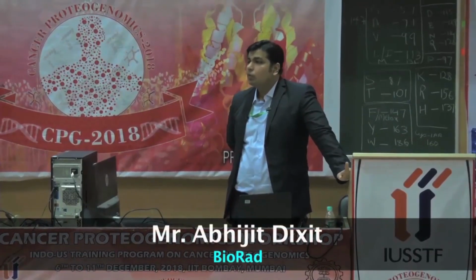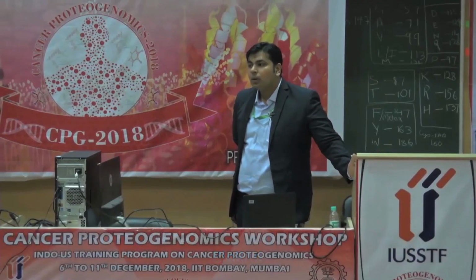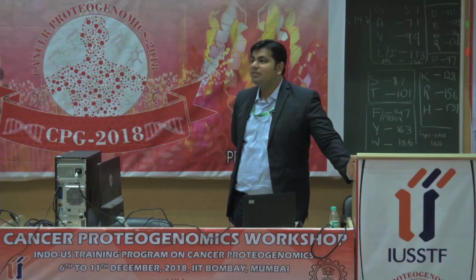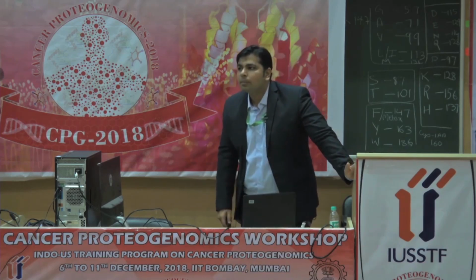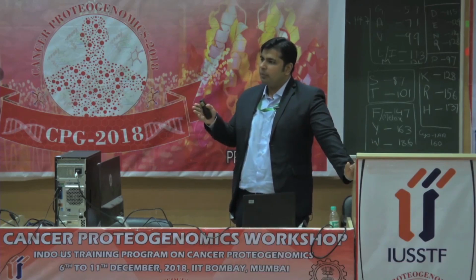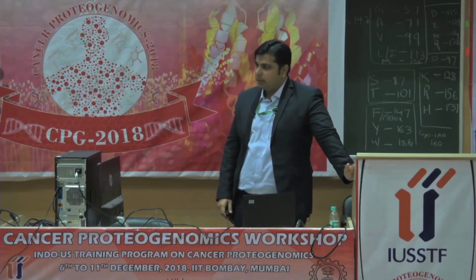Then you separate. So you want to do a separation by this method? No, separation you will have to do by any other method. The PCR can happen here. The PCR and the quantification later part can happen in this. What you are talking of is also a different technology which we have. So, it is a workflow, ma'am, where you isolate your single cells by flow cytometer and then go ahead with this. Correct.